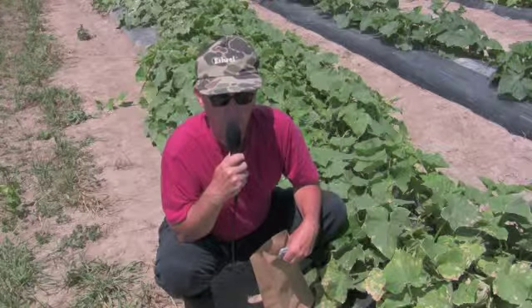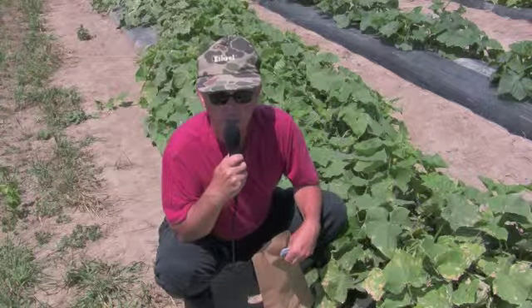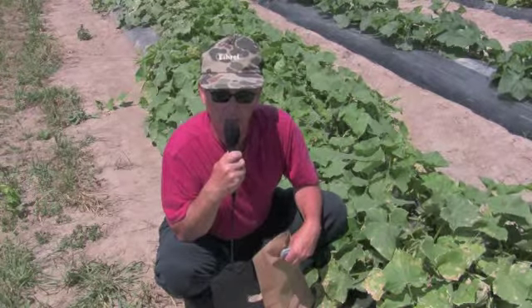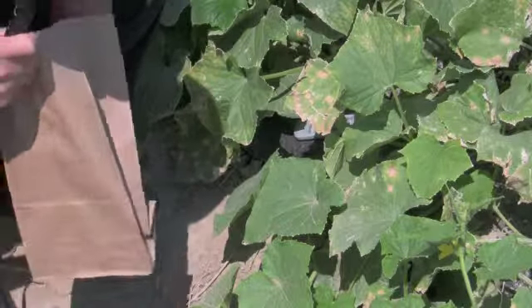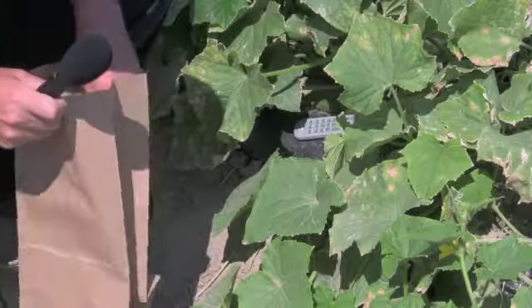If we had a definite wilt problem here, we would need to take a whole plant sample so we could look at the stem and also the roots to see if there's anything going on in that part of the plant. So what I'm going to do is take some representative leaf samples, and in this case I have a paper bag. See what I'm talking about here.